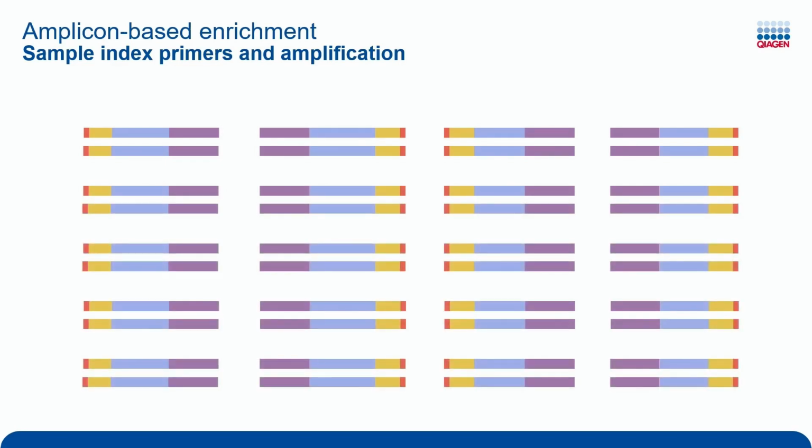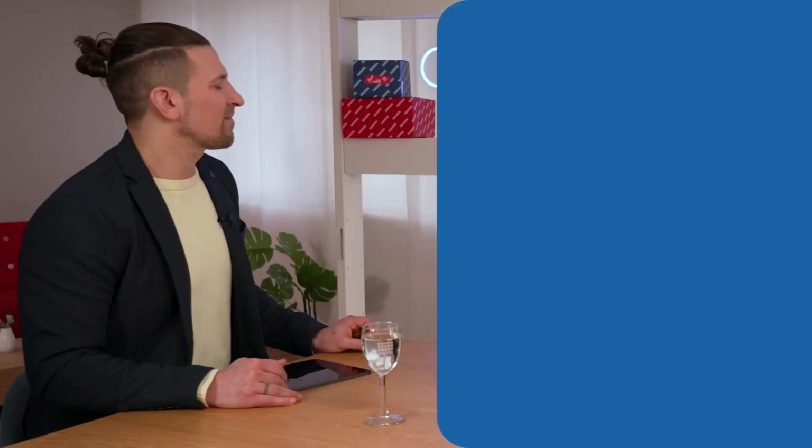Because these adapters that we ligate carry unique molecular indexes, that makes this method ideal for oncology applications, as we can trace back every single input molecule and can be highly sensitive with these panels. So I think that we do have a short video about that. Ellen, can you tell us more?